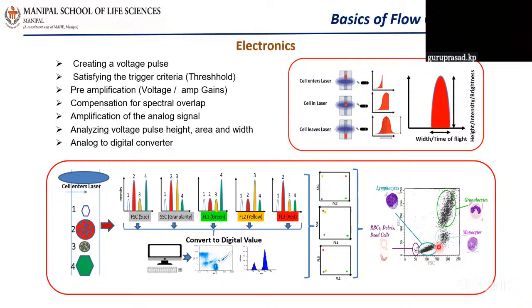So that means these are agranular cells, because remember, I am taking WBCs. WBCs include lymphocytes, monocytes, macrophages, eosinophils, basophils and neutrophils, and the agranular cells are basically the lymphocytes. So this cluster is basically lymphocytes. You can see the picture here also.